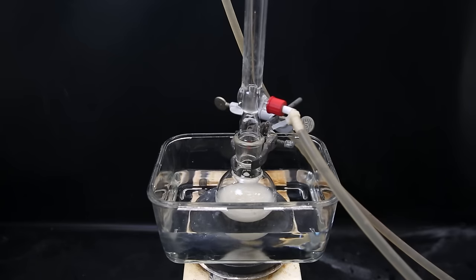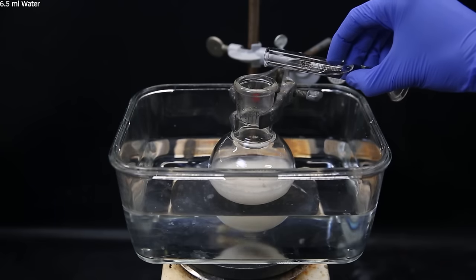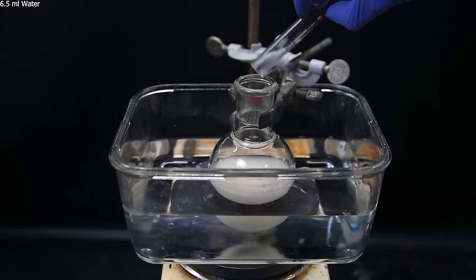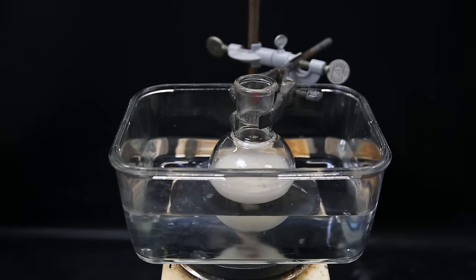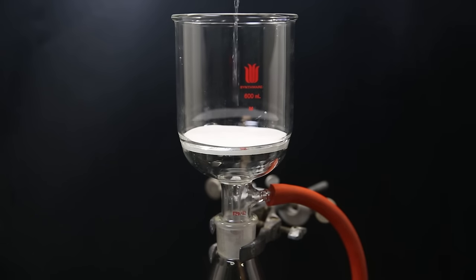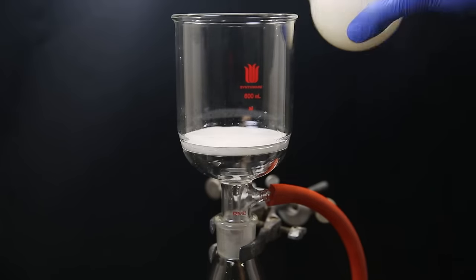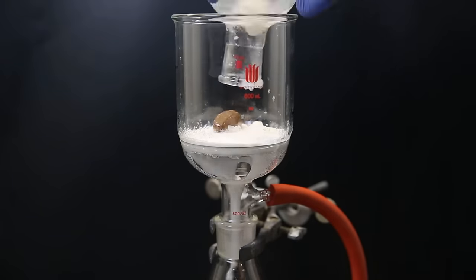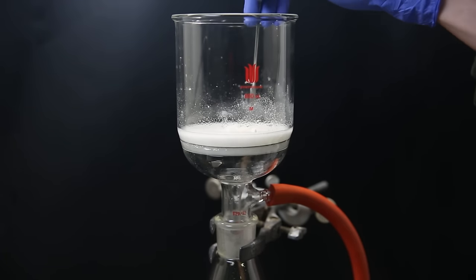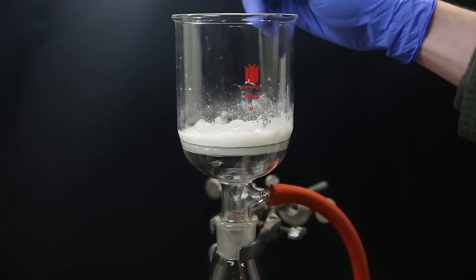I cool it down in a water bath and then add in 6.5 mL of water to destroy any remaining benzoyl chloride. I leave it to stir for 30 minutes to make sure it is all destroyed, and then take the mixture and set it up for vacuum filtration. I wet the filter with ethyl acetate and then filter it all through. I then wash the white residue with some ethyl acetate and let it dry on the filter for 15 minutes.